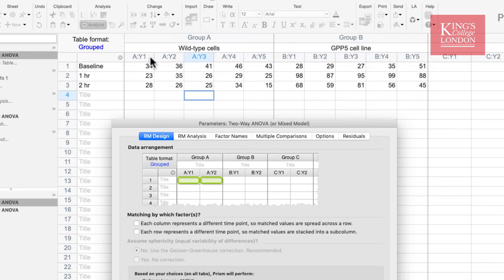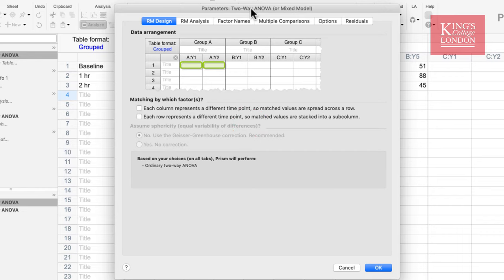But if this was a biological entity that could be measured over the three different time periods, we could choose a repeated measures analysis, as long as our data are organized correctly. For instance, Y1 would need to include the information from only one N — in other words, the 34, 23 and 28 results on the screen were taken from the same biological entity. Y2, Y3, Y4 and Y5 would contain the information from the second, third, fourth and fifth entity. If the data are not entered in this way, your repeated measures analysis will not work correctly.